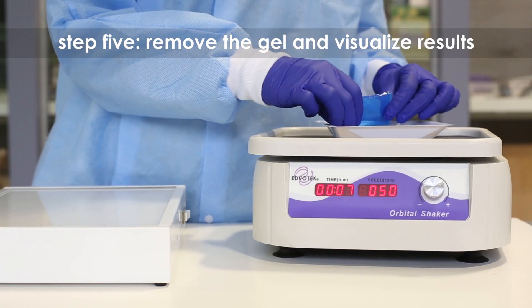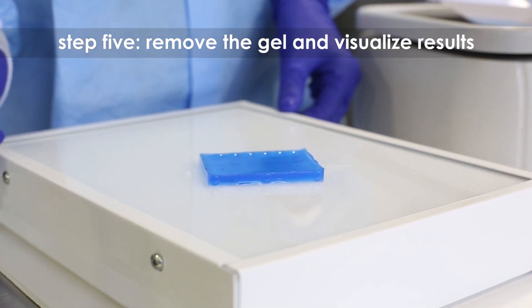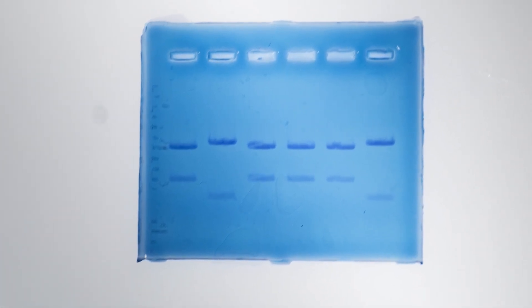Step 5. Remove the gel from the destaining liquid. Visualize the results using a white light visualization system. The DNA will appear as dark blue bands on a light blue background.